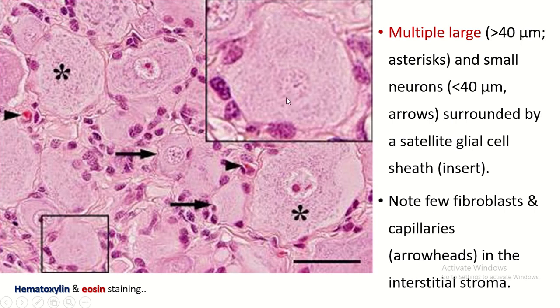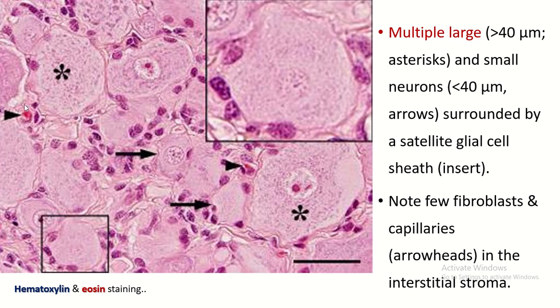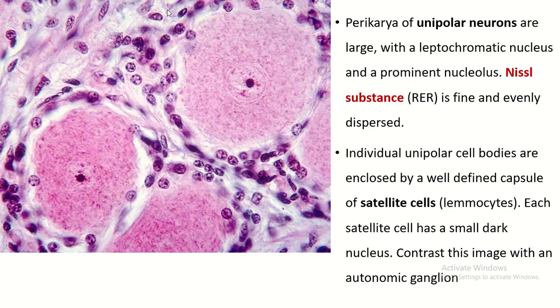This is the cell body of the sensory neuron and this is the satellite cell. See the nucleus of the satellite cell — it is darkly stained. This is the capillary and this is the fibroblast. This is the nucleus of the cell body of the sensory neuron with prominent nucleolus, and this is the cytoplasm. You see the distribution of Nissl granules; it is fine and evenly dispersed. This is the satellite cell — you can see the nucleus of the satellite cell, which is darkly stained.